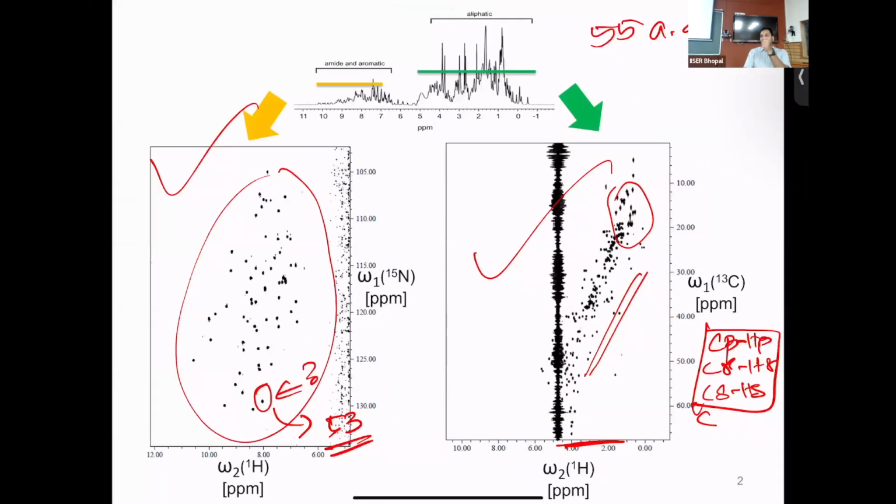Now, do you realize that is the fingerprint of your protein molecule, and any changes can be seen: actually only this residue reacted to the change while the other did not. That's the power of NMR. And you don't destroy the sample. You still see the system as it is. You see it at equilibrium, and you can study it near physiological conditions without any changes. The only disadvantage is that you need a lot of concentration.